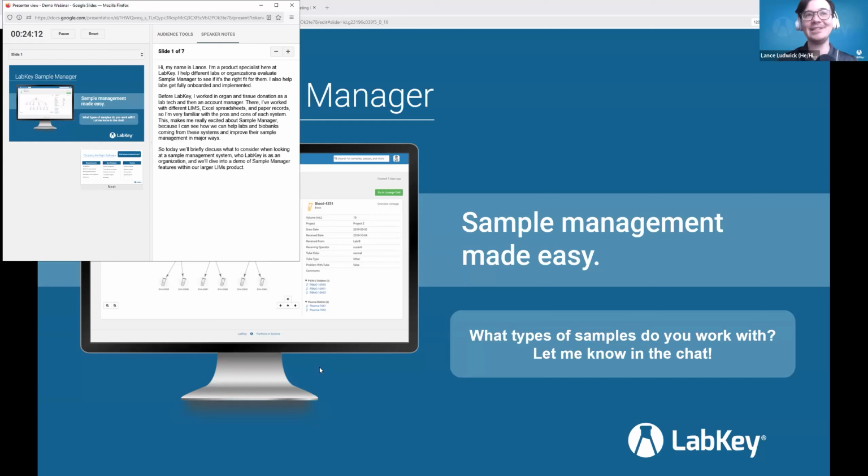This makes me really excited to talk more about Sample Manager because I can see how we can help labs and biobanks coming from these systems and improve their sample management in major ways. So today we'll briefly discuss what to consider when looking at a sample management system, who LabKey is as an organization, and we'll dive into a demo of Sample Manager with features within our larger LIMS product.